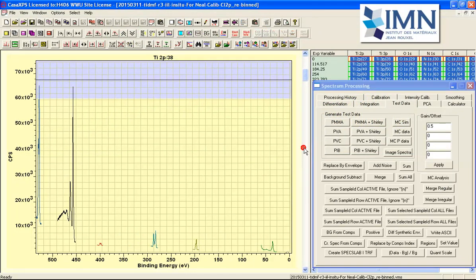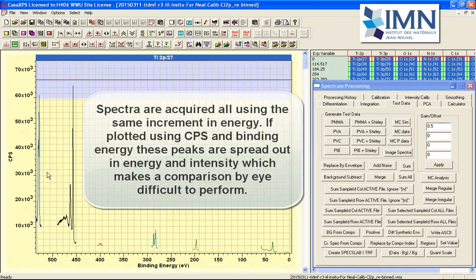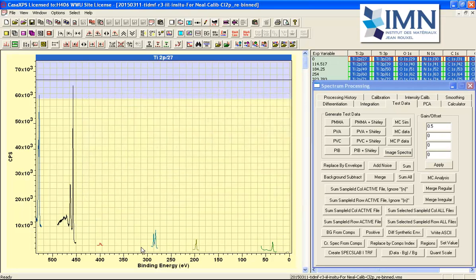And you can see in this scroll list we've got each one of the rows in the right hand side now appear overlaid in these display tiles, and you can see the relationship that the relative intensity of these peaks is based on the photo emission process and the response of the instrument, and also these peaks are spread out in kinetic energy, so they are over quite a wide range, and it's not easy to see at a glance all of these individual smaller peaks.